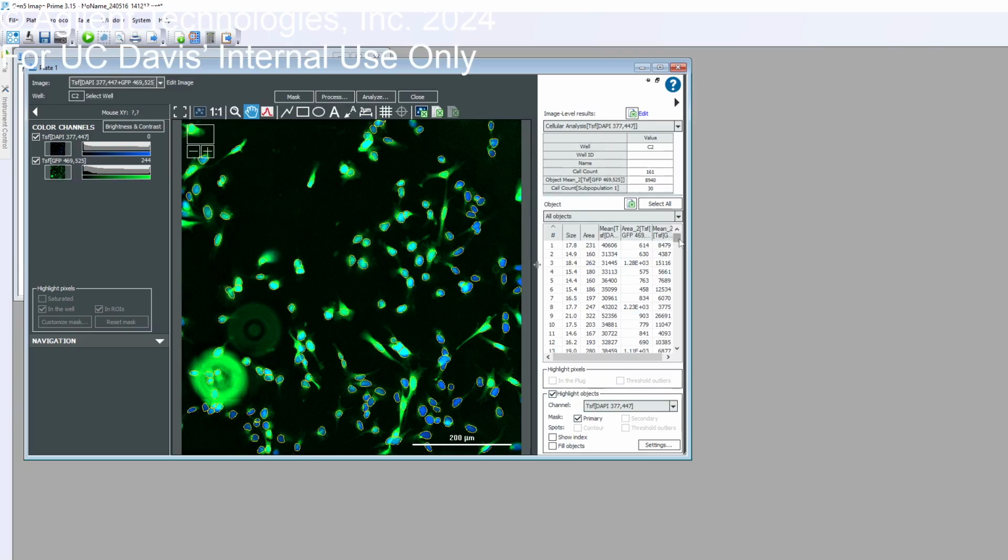Could be probably, yeah. Is there a way to show that histogram here like you did before? So there is, but it's not here. So you can close this. When you set up the histogram, we have to add the step at that moment. So when it's open, we have to add that step, and it will populate here. If you click on data, it will have one of the histograms. Click on the picture, histogram size, and this is just one pre-created one. It's going to pop up here in that section. Click that. And then what else? So exporting the data.